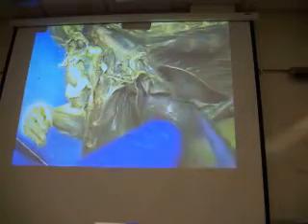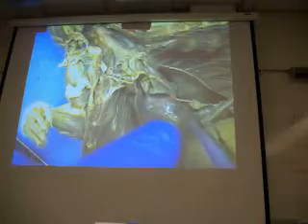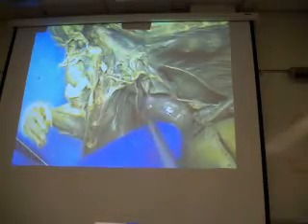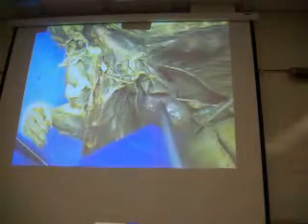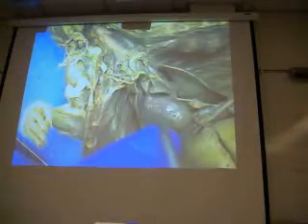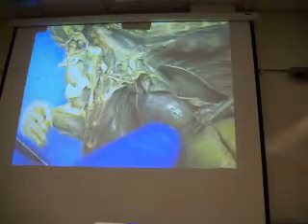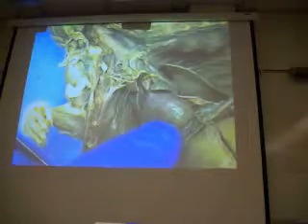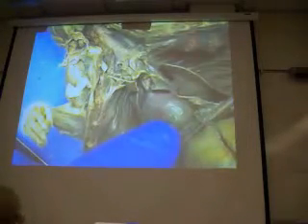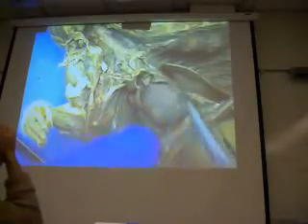I could ask you, not necessarily on this particular one because it's not noticeable, but the left ventricle is on this side and the right ventricle is over here on this side. But usually you'll see this little sulcus, which is a little groove, right? And inside that groove you'll see some of the coronary vessels. So when we open up the sheep heart, and look at the fetal pig, you'll be able to notice those. And even some of the other rats you should be able to notice as well. Okay? So there's the heart right there.